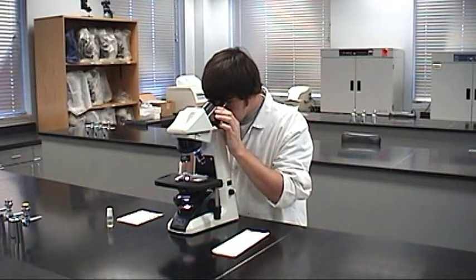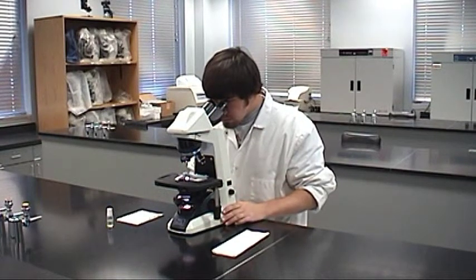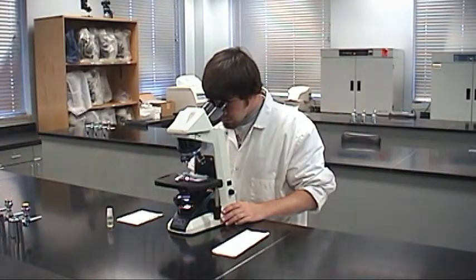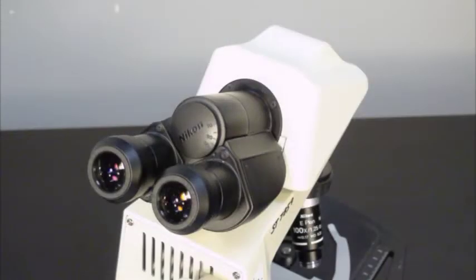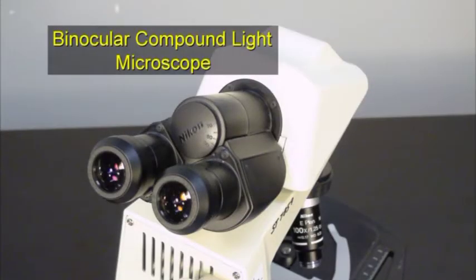This video gives you an overview of the parts of a microscope and their functions. The microscope you will use in this course is a binocular compound light microscope. This description lists features that distinguish it from other types of microscope.